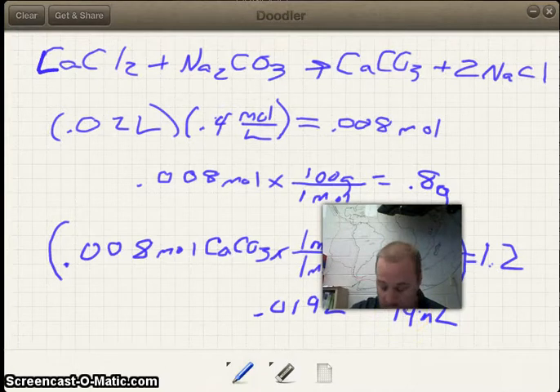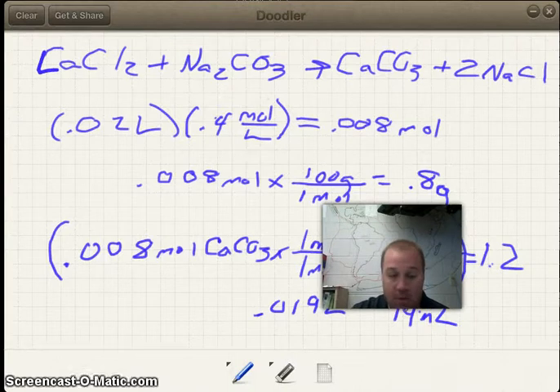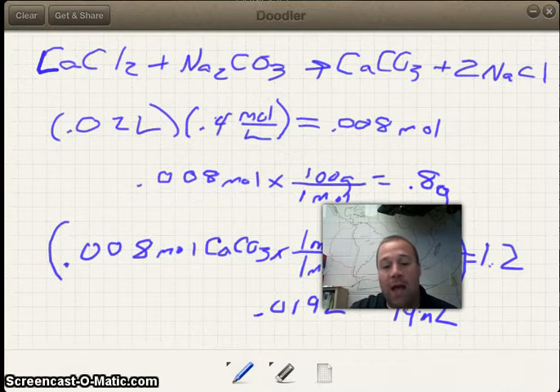So that should fill in the next column, which is volume of 0.5 molar Na2CO3 to add. The final column is the theoretical water hardness. If you just follow the example that is given to you right in problem number 6, you should be able to fill in that chart as you go down. So now that you have all that chart filled in, you need to design the procedure for how you are going to do the reaction. It's going to be just like what you did on the first day. So how are you going to do the reaction?